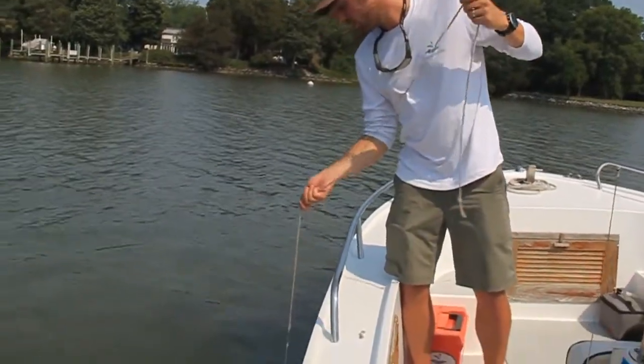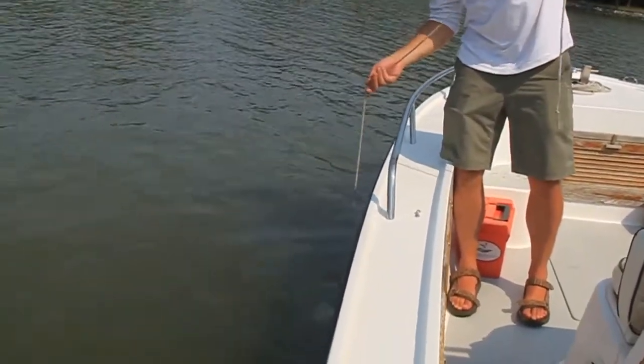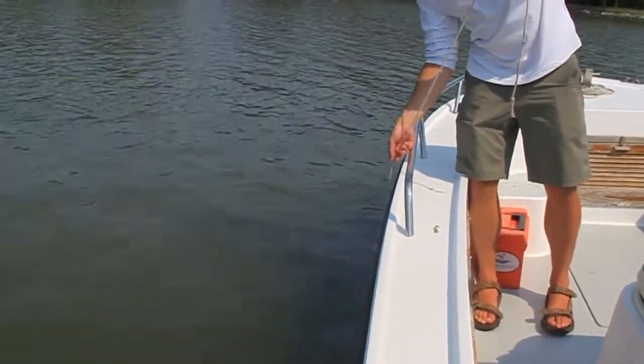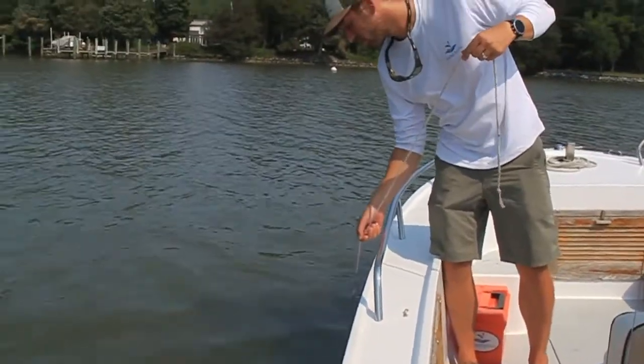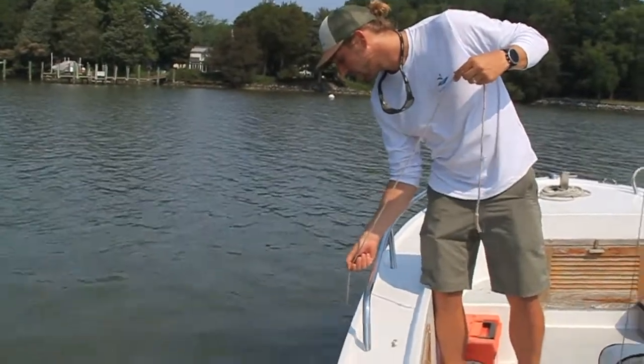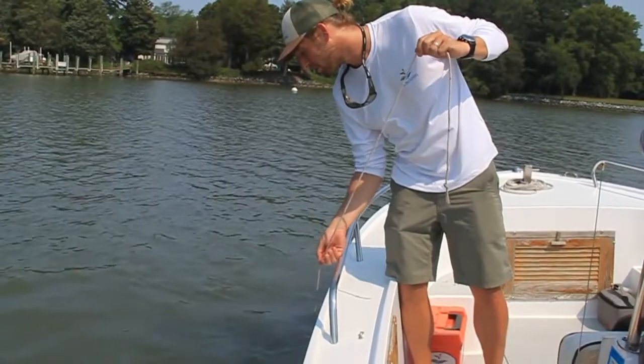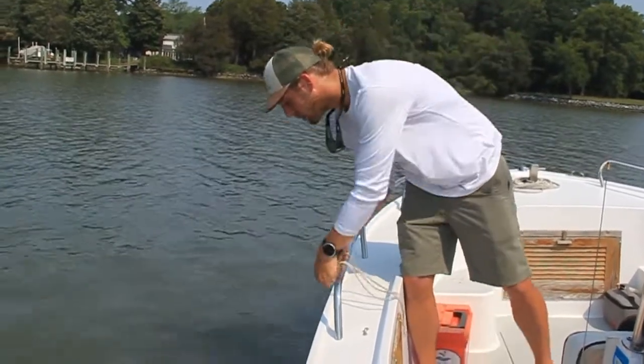You'll drop it down into a shaded part of the water, so you want to have it shaded, and you'll essentially drop it down until you can't see it anymore. And the method that I like to use best is to go down till you can't see it, raise it up again till you can see it, and then give it one more drop down so you are a little more certain exactly where that is.